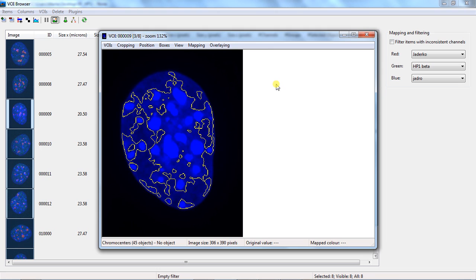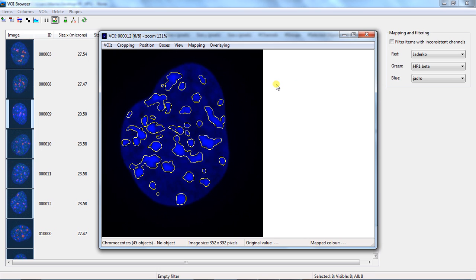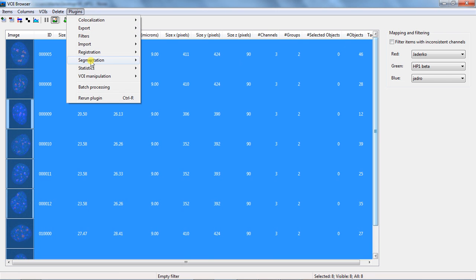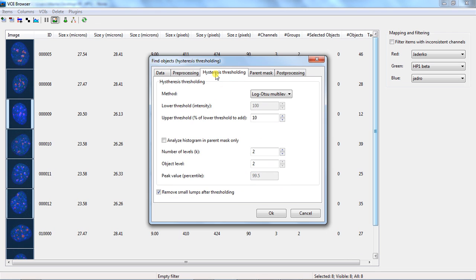Notice the unsatisfactory result in 4 images starting from the third one. Let's recompute these 4 images from the third one using the same output group, with the only difference, and it's incrementing the number of expected intensity levels of the images.